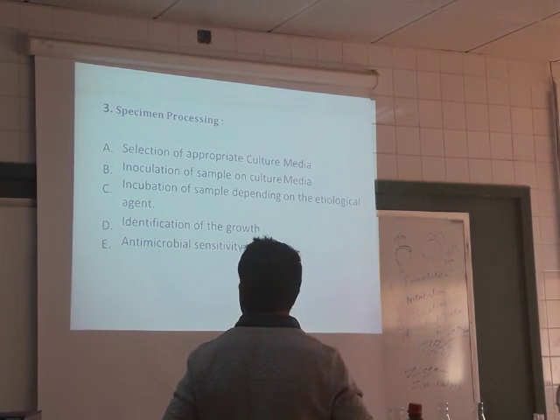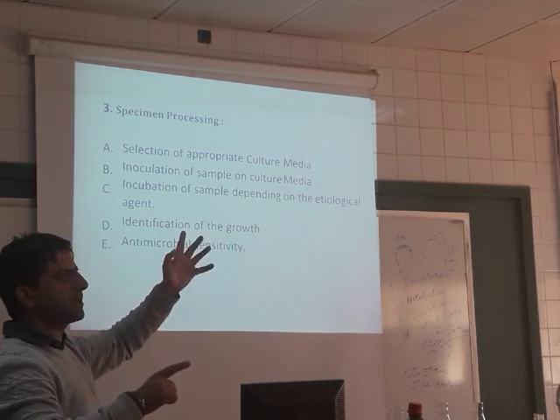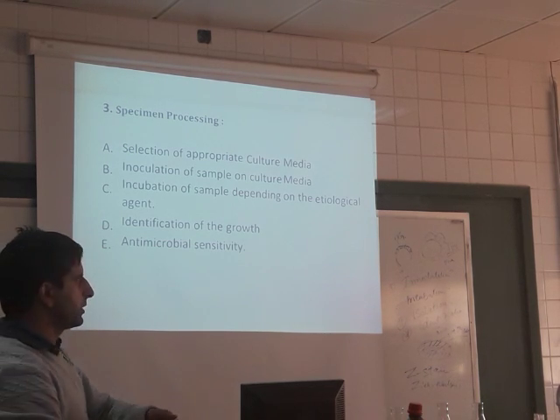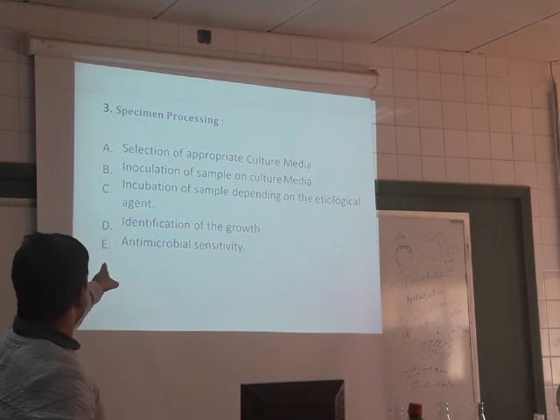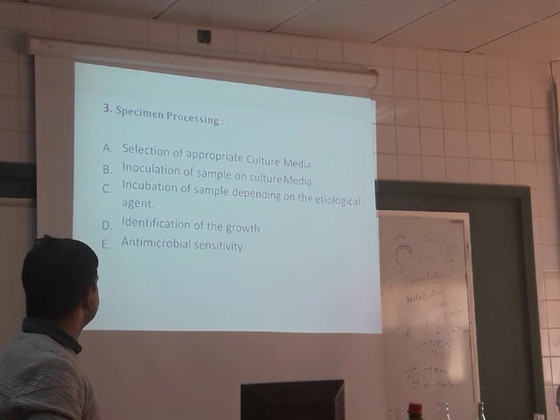Proper culture media, either MacConkey, nutrient agar, or blood agar, okay? Then you inoculate, as I told you, inoculation. Then you incubate, then the identification. But isolation is also there, okay?